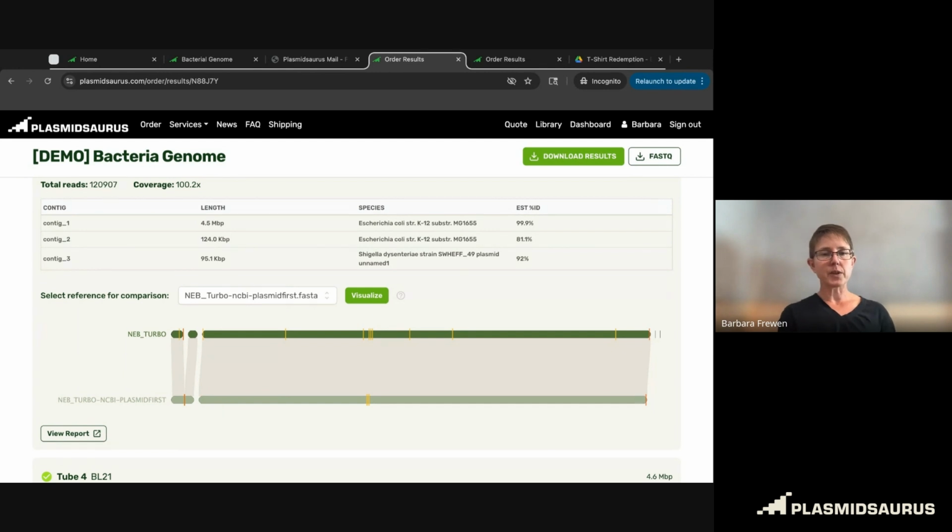So it's a visual that gives you quite a bit of information at a high level, a lot more to infer about what these three contigs are and how similar they are from the published reference. Overall, very, very similar with just a handful of SNPs and indels.